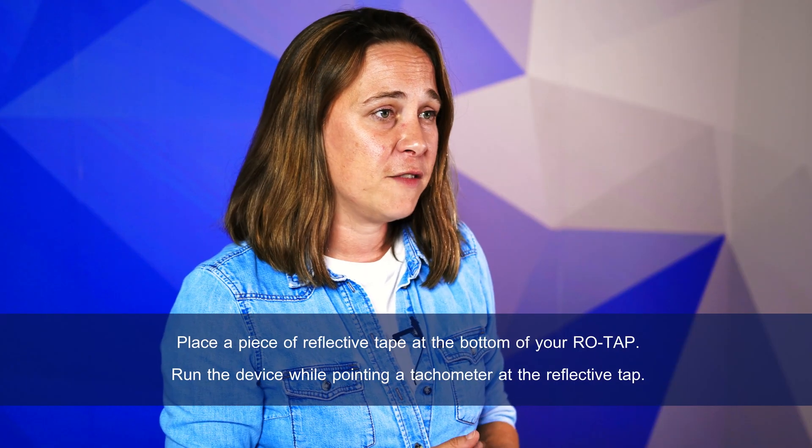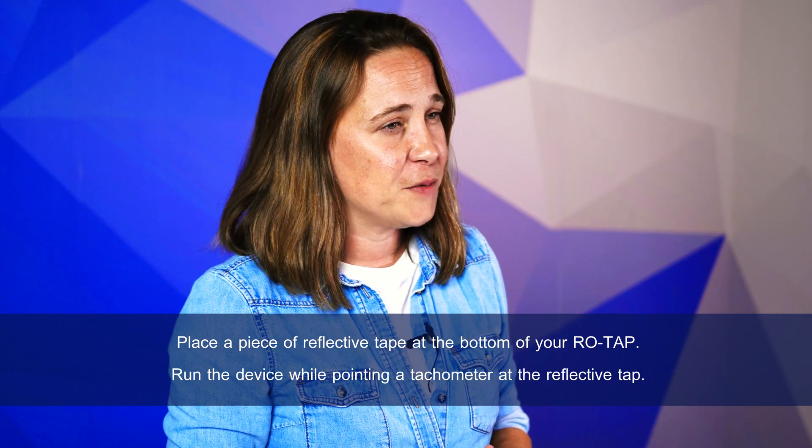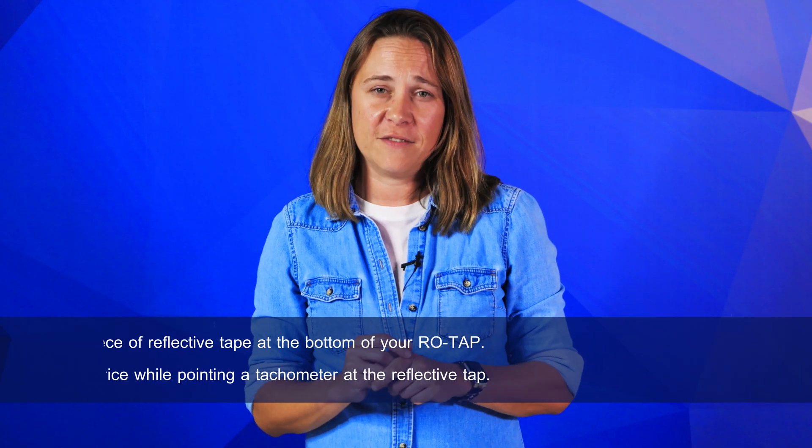And if you want to test the RPMs of the device, start by placing a piece of reflective tape at the bottom of your Rotap. You'll then want to run the device while pointing a tachometer at the reflective tape. The tachometer will measure how much the device moves in a minute and verify the motor's RPMs.